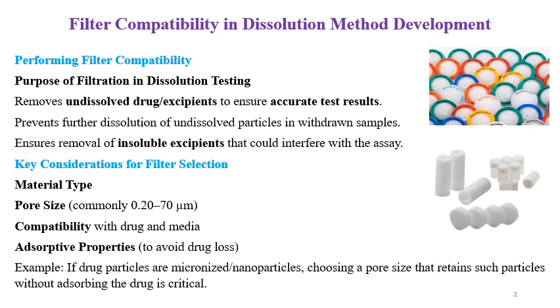Filtration prevents further dissolution of the undissolved particles in the withdrawn samples. For example, you have withdrawn the samples with the undissolved particles and you are keeping them for the analysis. In that period, these particles will dissolve further and it will hamper your results. That means the actual dissolution was less, but due to this dissolution after the removal of the sample, you may get somewhat higher results.